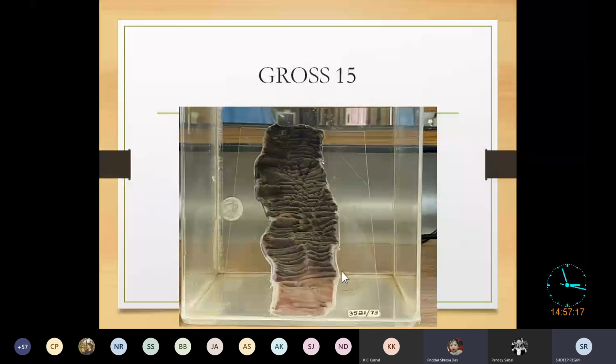Sir, there is a well demarcated gray-black area. Okay. Answer, the bowel is normal. So here you can see the gangrenous area, which is brownish black or dark. Here you can see a well demarcated area, from where we can see the normal bowel is there.